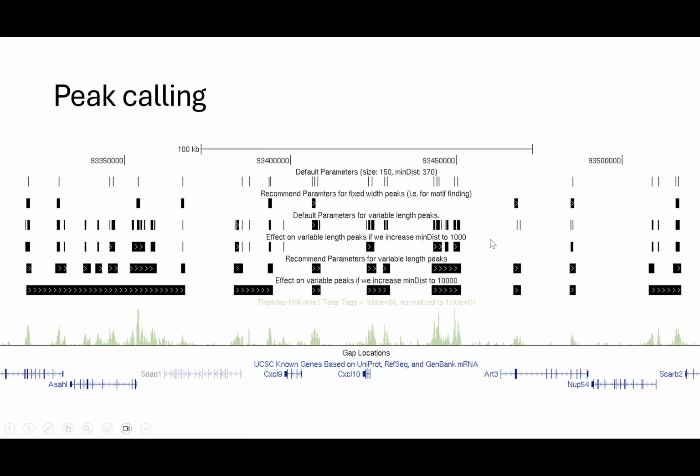So just have a little bit of knowledge that what you put into this could change your results a bit. That could be one reason why one person might find a different result for the same target than you did. So it's a good idea to try analyzing the data again with your own peak calling method to see if that was causing some of the difference.